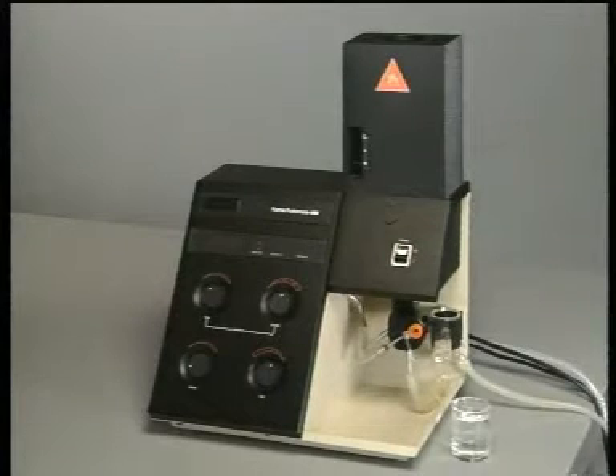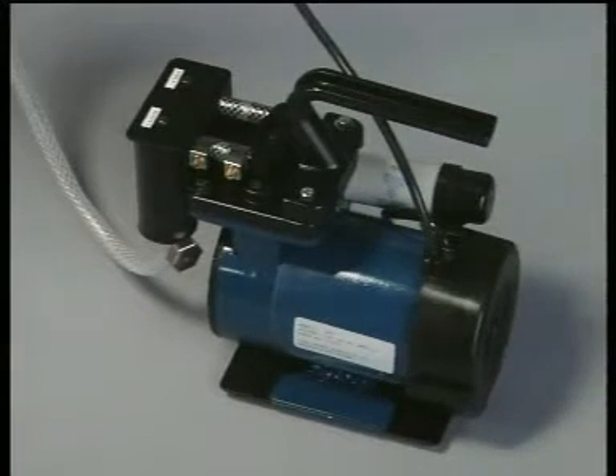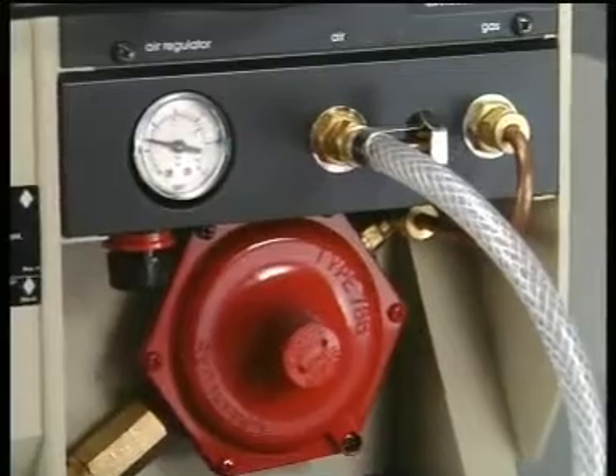Air and gas lines are attached to the back of the instrument. In this case, the air is supplied by a small pump. The gas supply passes through a secondary regulator valve before entering the instrument. Here, the valve is painted red.